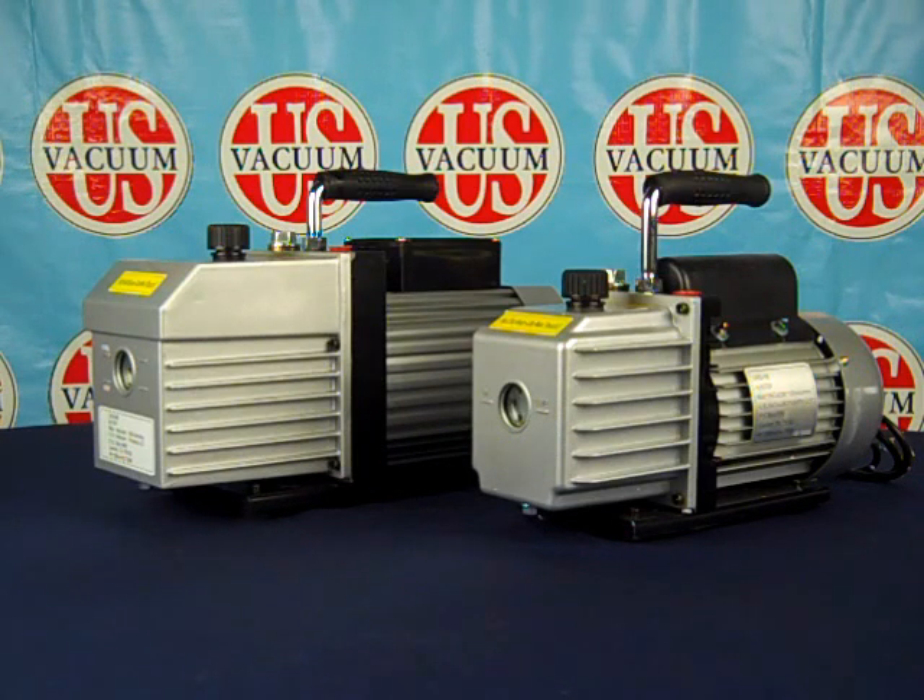This introduction will detail the standard components included with your pump purchase, along with accessory items commonly used with these pumps. The CPS-5B and CPS-8B are designed for pumping clean, dry, non-reactive gases and vapors, such as air and nitrogen. In no circumstances should these pumps be used to pump flammable, explosive, or corrosive gases and vapors.